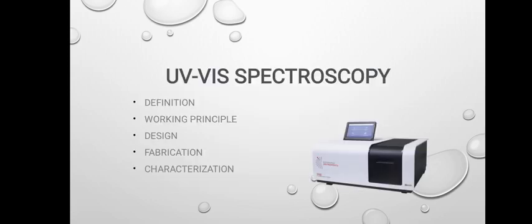First of all, we will discuss UV visible spectroscopy's definition, then working principle, then design, then fabrication, and then characterization.